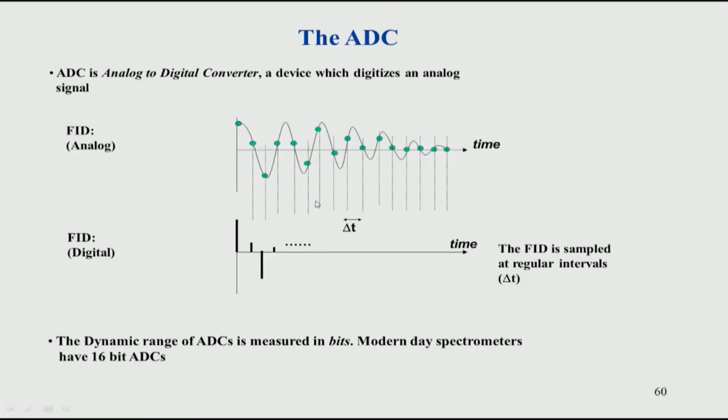And finally, when we look at the FID, this is how the FID comes out of the spectrometer; the spectrometer gives you a signal like this. This is called an FID, and as I mentioned in the last class, we actually digitize the FID. The FID is taken at every point here, and this is called digitization, and this is how the signal will look. It is like a sine wave, but now discretized, digitized, and the distance between two successive points is known as the dwell time. This dwell time is again a very important parameter when you set up NMR experiments.